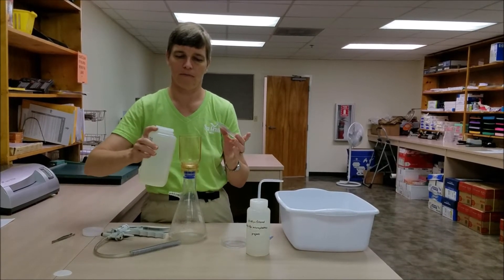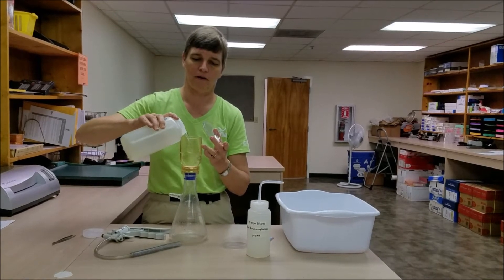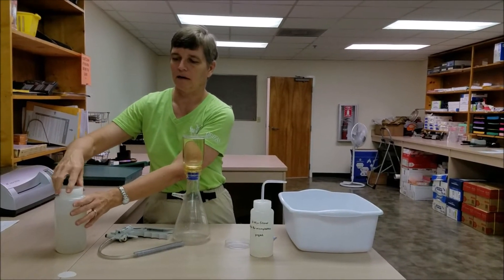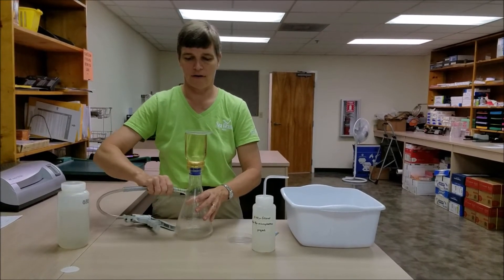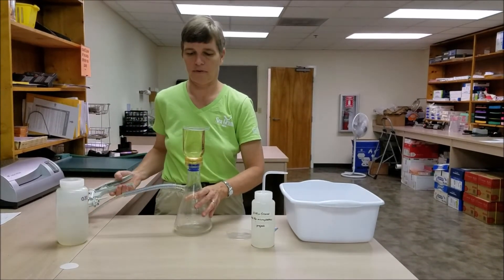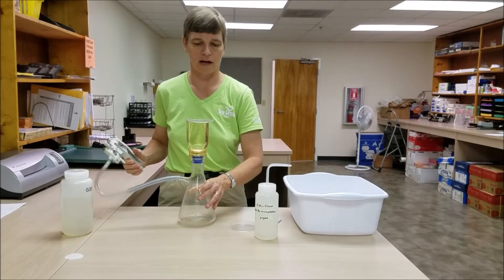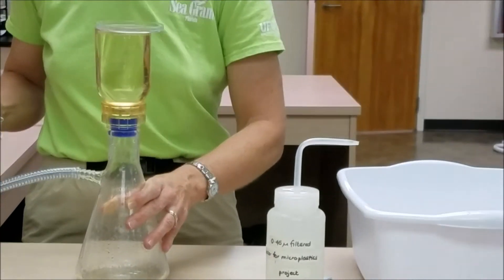We're going to take our sample and fill our filter paper holder. Place the petri dish on top, and immediately put the lid back on our sample bottle to prevent contamination. We'll then attach our vacuum pump and apply vacuum. It's always a good idea to hold on to the Erlenmeyer flask to keep it steady and prevent it from tipping and spilling your sample.